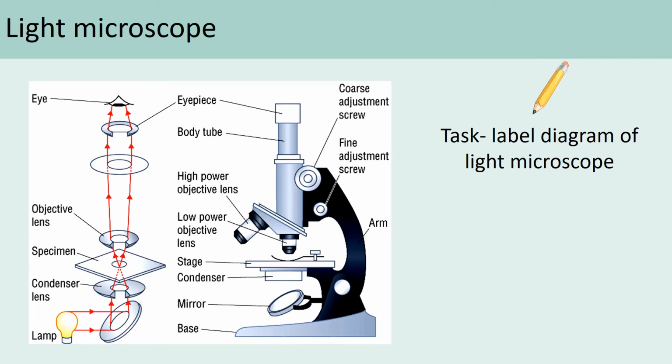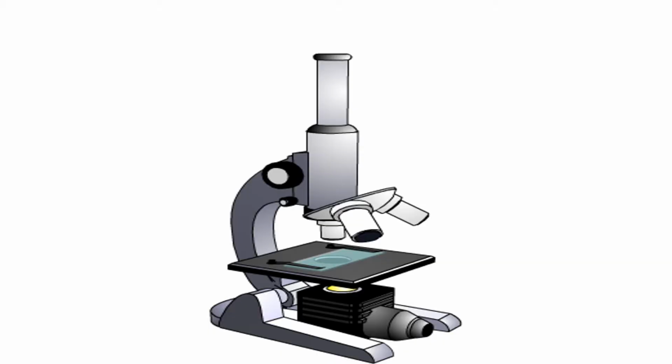So at the end of this PowerPoint, there is a microscope slide, so you might wish to print that off and have a go at labelling yourself. Here is another one here. So just have a quick look. Can you remember, where is the eyepiece lens? Point at the screen. Where is the objective lens? Where is the coarse focus? Where is the stage? Etc. Okay, eyepiece lens times objective lens gives you the total magnification. Now this is quite a basic one.